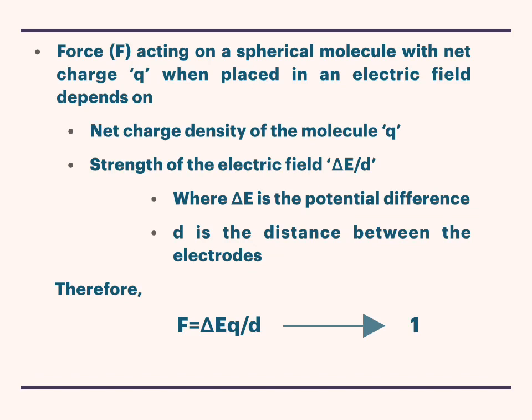Now, for our understanding of the principle of electrophoresis, let us consider a spherical molecule which has a charge Q and is placed in an electric field. Because of this electric field and the charge present on the molecule, a certain force will develop on this molecule.